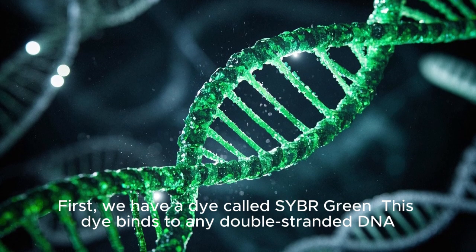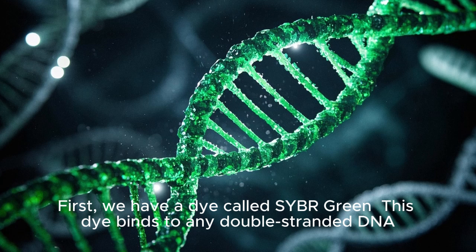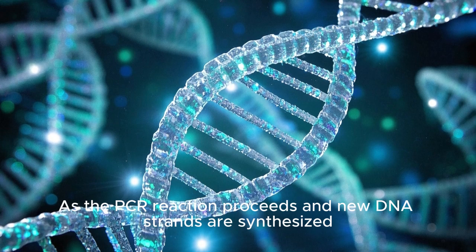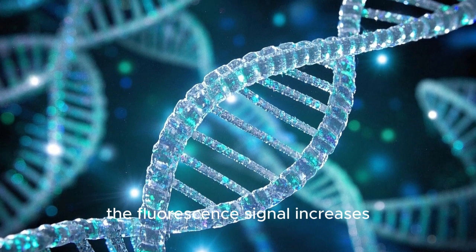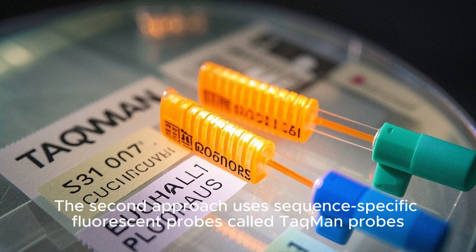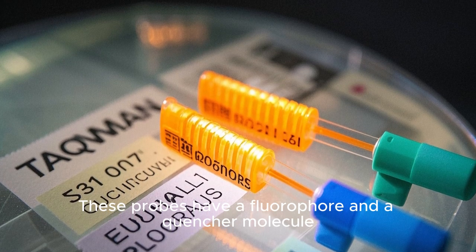First, we have a dye called SYBR green. This dye binds to any double-stranded DNA, meaning it's not specific to our target sequence. As the PCR reaction proceeds and new DNA strands are synthesized, the fluorescence signal increases. The second approach uses sequence-specific fluorescent probes called TaqMan probes. These probes have a fluorophore and a quencher molecule.